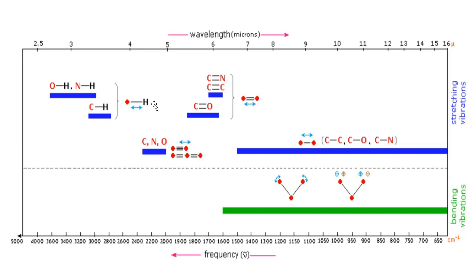That is the way the functional group is determined by using IR spectroscopy, right?